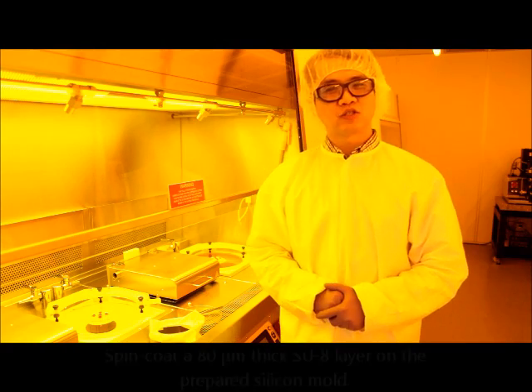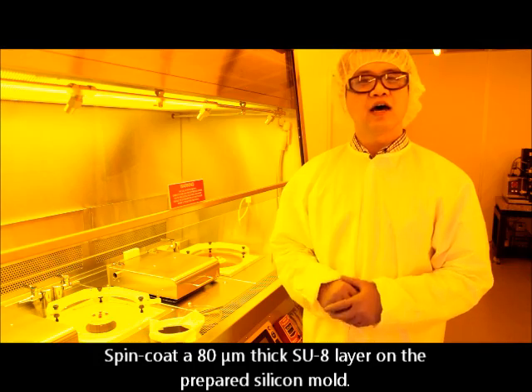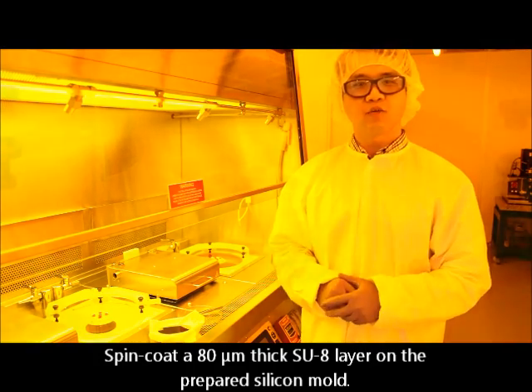The next step is to spin coat a thin layer of negative photo resist SU-8 onto the clean silicon wafer.